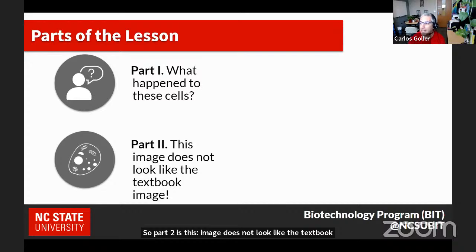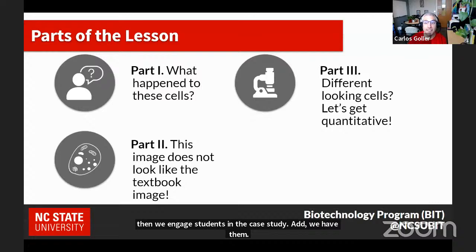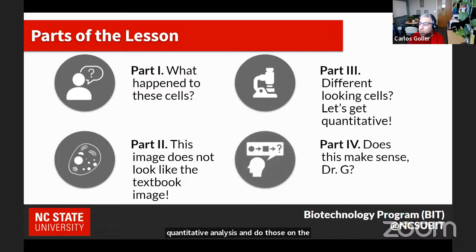What is happening? So then we engage students in the case study, and we have them observe different cells through the Allen Cell Viewer, the visual guide. And what's really powerful is that we're able to do some quantitative analysis and do those on the web. And finally, we ask participants, does this make sense? What would you recommend for Dr. G?